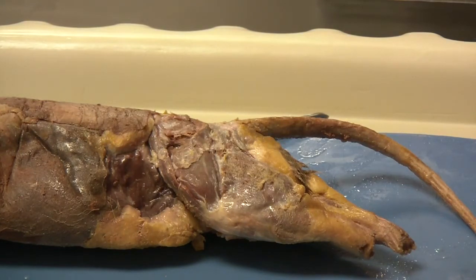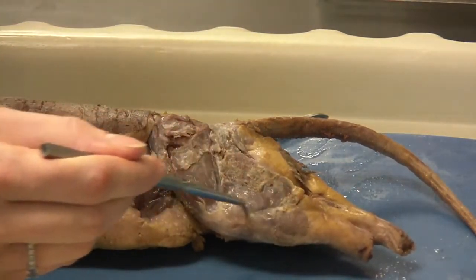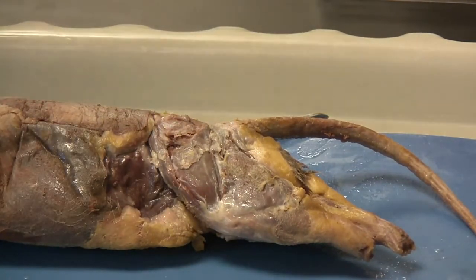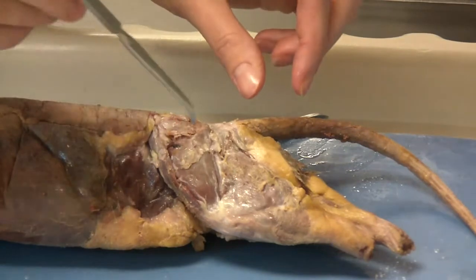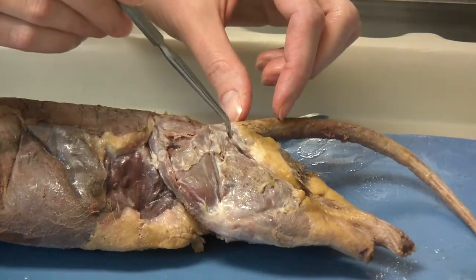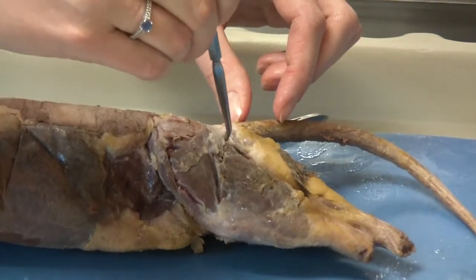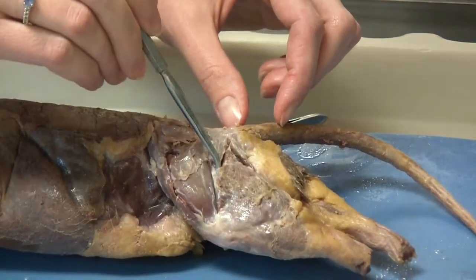The second part of the instructions indicates that we should remove the biceps femoris. The biceps femoris is this large triangular shaped muscle right here. The thing that you are going to want to focus on is not removing the caudofemoralis and semitendinosus muscles. The semitendinosus is right here by the tail — it's a very thin muscle, so make sure you have separated that out so you are not cutting off that portion. The caudofemoralis is just to the inside here; please make sure that you get your blunt dissecting probe down in there and separate that out.